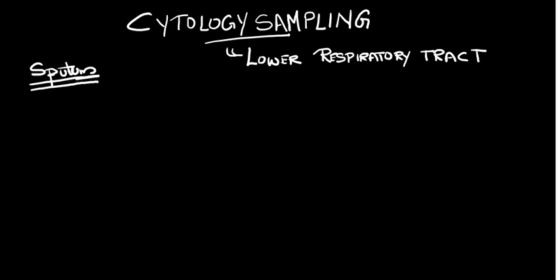So we have to teach them to bring out the sputum from within the lower respiratory tract, from the alveoli, and it should be deep sputum samples. And it is always ideal to take the sample in the early morning.